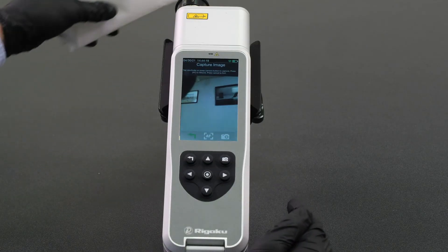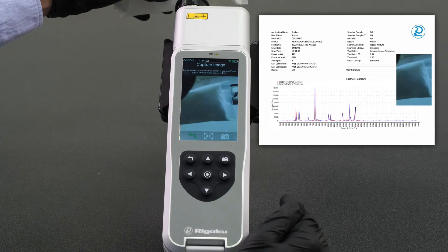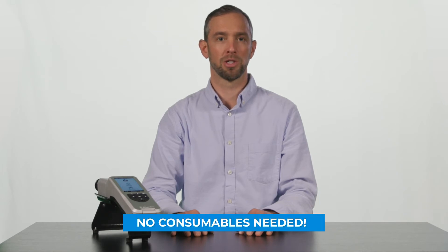With the Rescue Flex, you have the ability to take a photo of your sample with an onboard camera that will then automatically attach itself to your tamper-proof report. Another benefit is that because of the 1064 Raman Advantage, no consumables are needed.